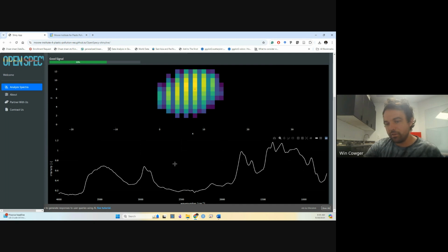Is that somewhat clear? I know it's a little bit of a fuzzy answer, but unfortunately there's not a rule like, this is always good signal, this is always bad signal. It somewhat depends on your use case. For microplastics research or particle research, when we're doing this kind of analysis, I think those are the main things to be thinking about: signal-to-noise ratio, artifacts, and how noisy the spectra is.